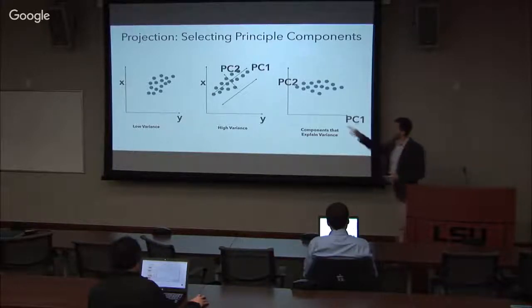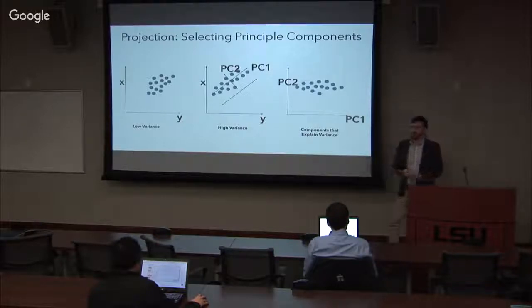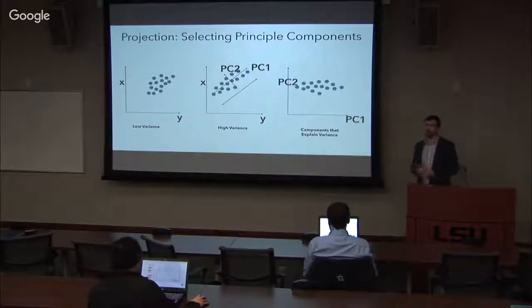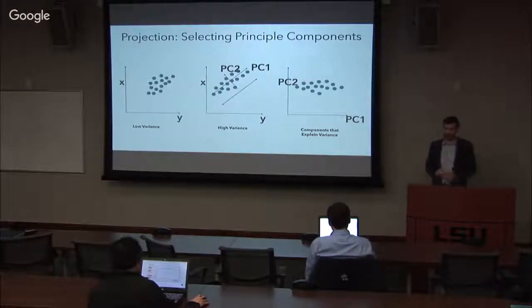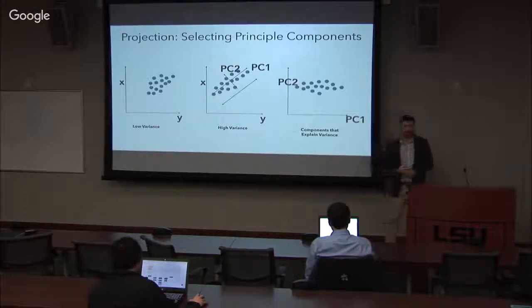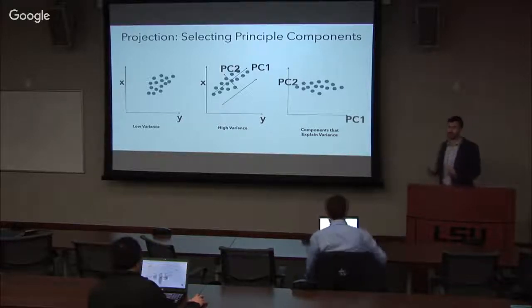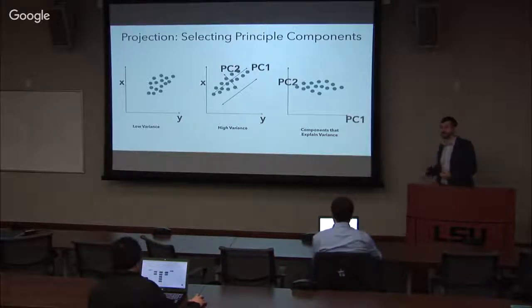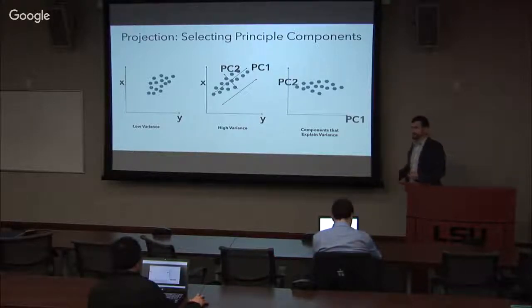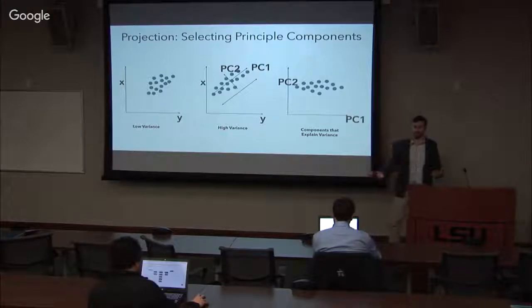And then within that high variance, we want to project new vectors and then project everything onto those two, or number three, components. As a result, we get PC1 and PC2 as our X and Y, and now we can project everything onto those new components. What does it give us? It gives us the location of each sample within the space of variance of our whole data set.